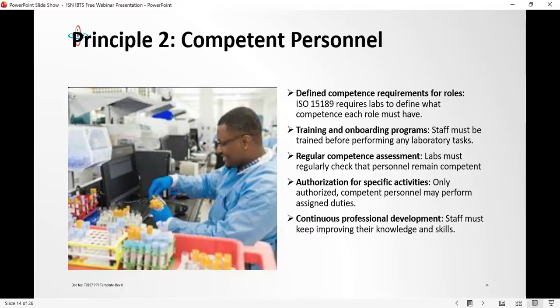Do we document how, when new people come in, we onboard them into the system? It is a requirement of ISO 15189:2022 that it is documented so that it is consistent. Do you have a training plan? Even for retraining the old scientists, sometimes we tend to believe we know it.